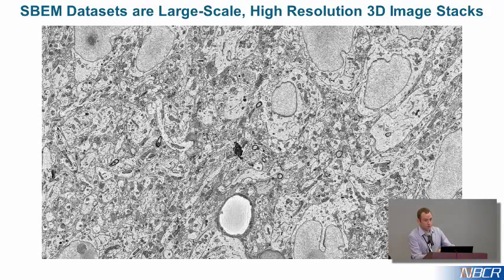So what you can see here is we've segmented entire neurons in the plane of that data set and then automatically reconstructed all of the organelles inside using the tools that will be introduced today. So there's a nucleus in yellow. All the green guys are mitochondria that were automatically reconstructed.